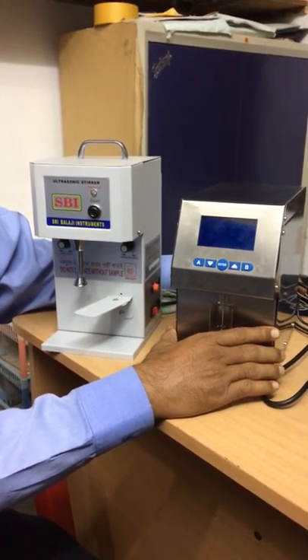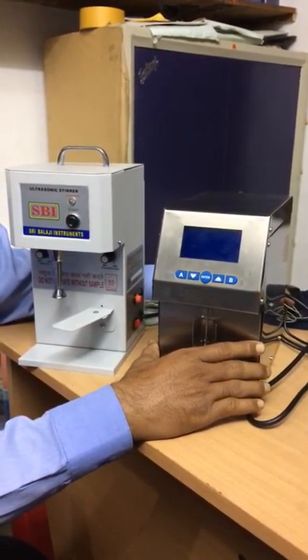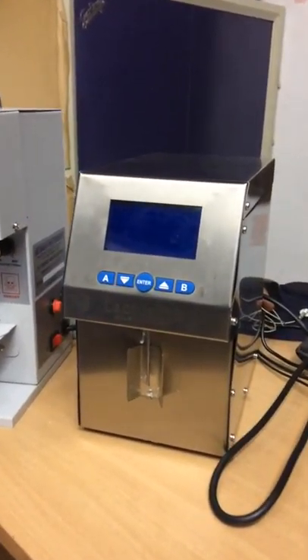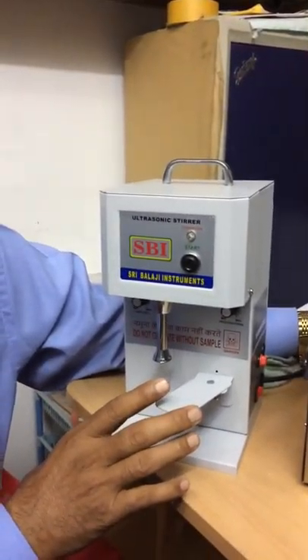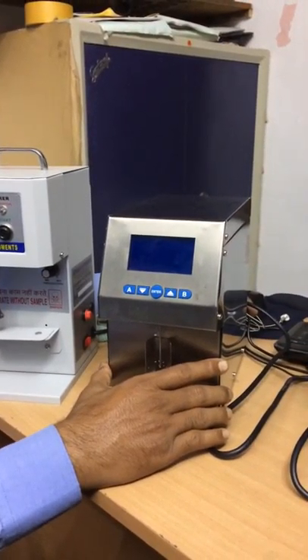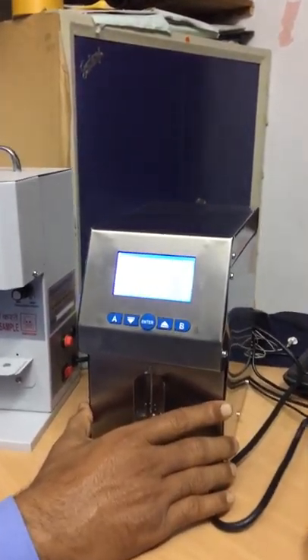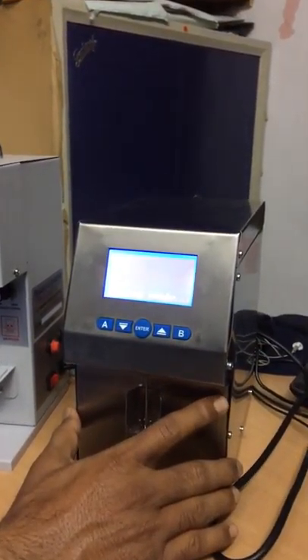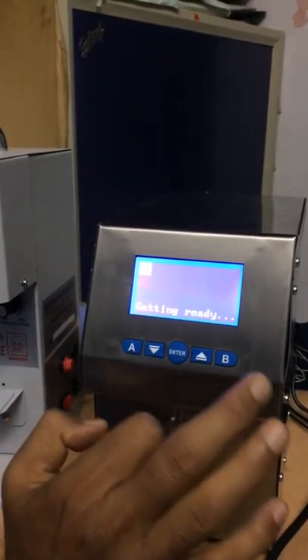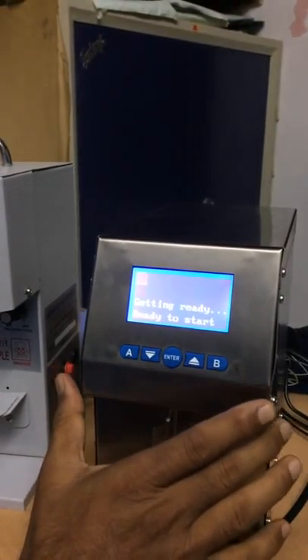Today we see how LactoScan milk analyzer works. Here is the LactoScan milk analyzer — we also have an SBI ultrasonic stirrer. Let us see how it works. Now I am turning on the analyzer; there is a switch on the backside. I just turned it on and it is getting ready.